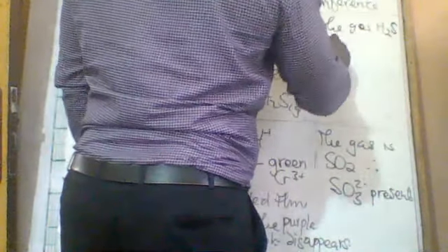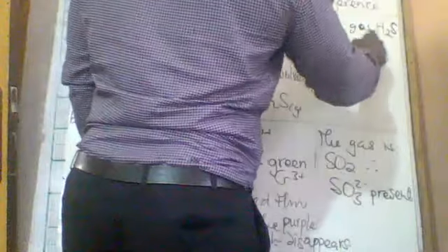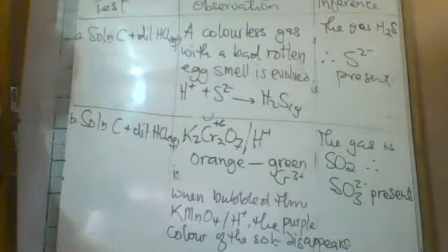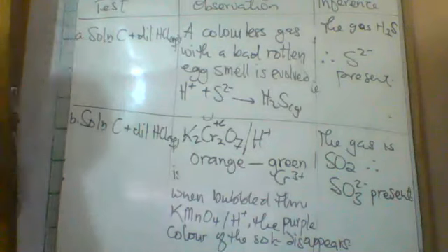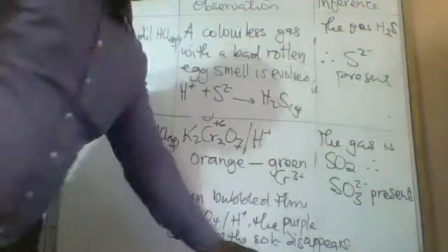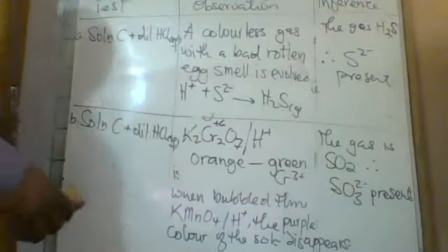Therefore, S2 minus present. S2 minus present. That is about the S2 minus.